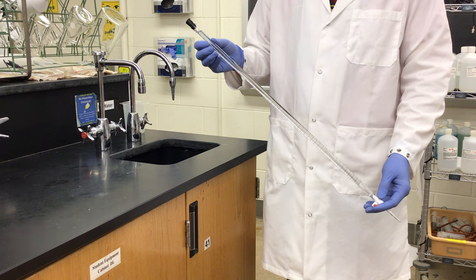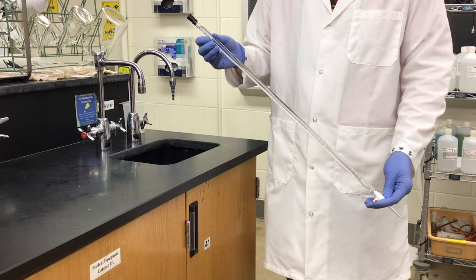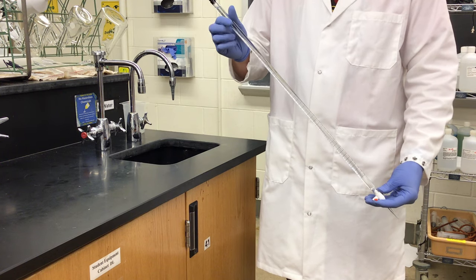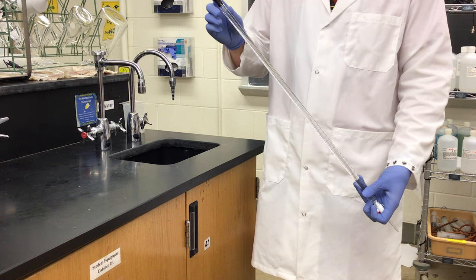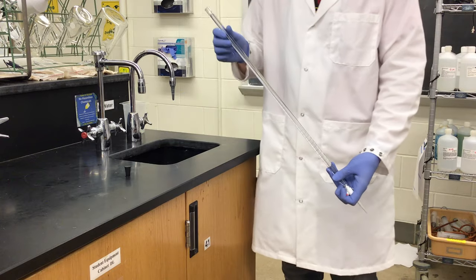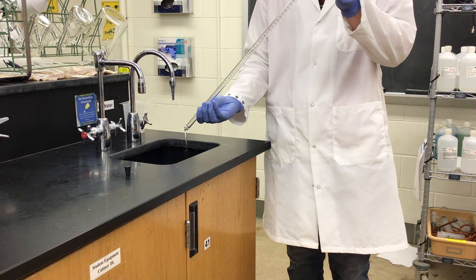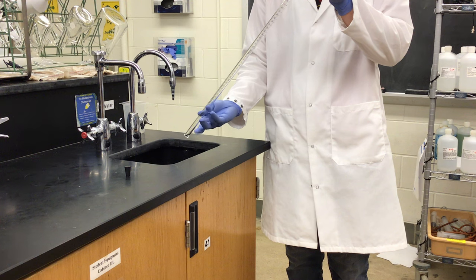Here I have a 50 mL burette stored in the lab — you will find these when you need them. They are stored with water in them to keep them clean. To begin, we need to take the rubber stopper off, go to our sink, invert, and open the stopcock to let all the water escape from the burette.